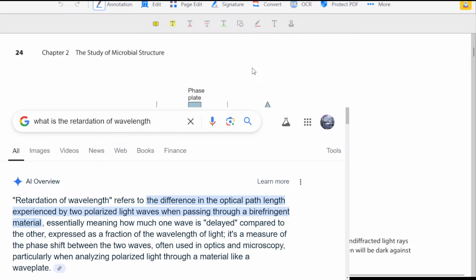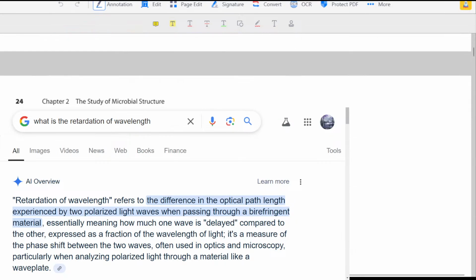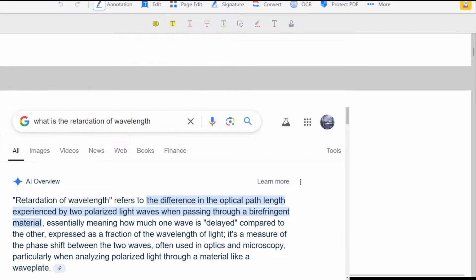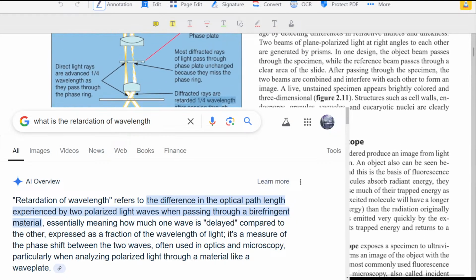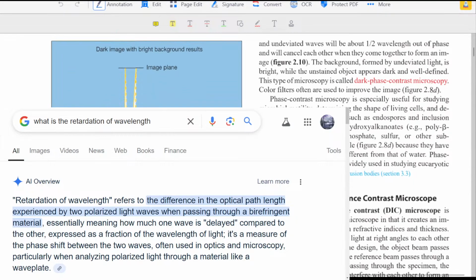So when they come across each other, they cancel out one another in the lens, because the lens focuses those two at the center point. And here they cannot cancel one another because they are not crossing one another directly, while in the lens they do cross one another directly at a focal point. I see.